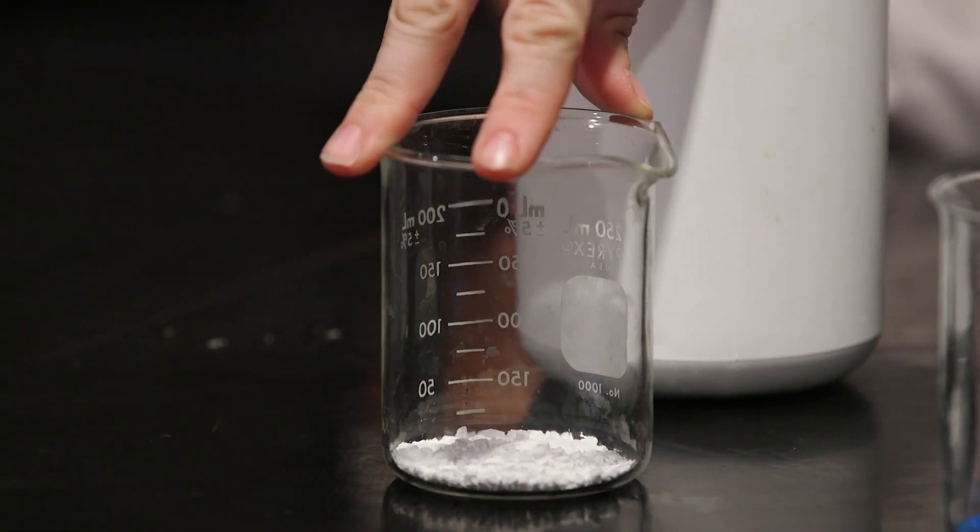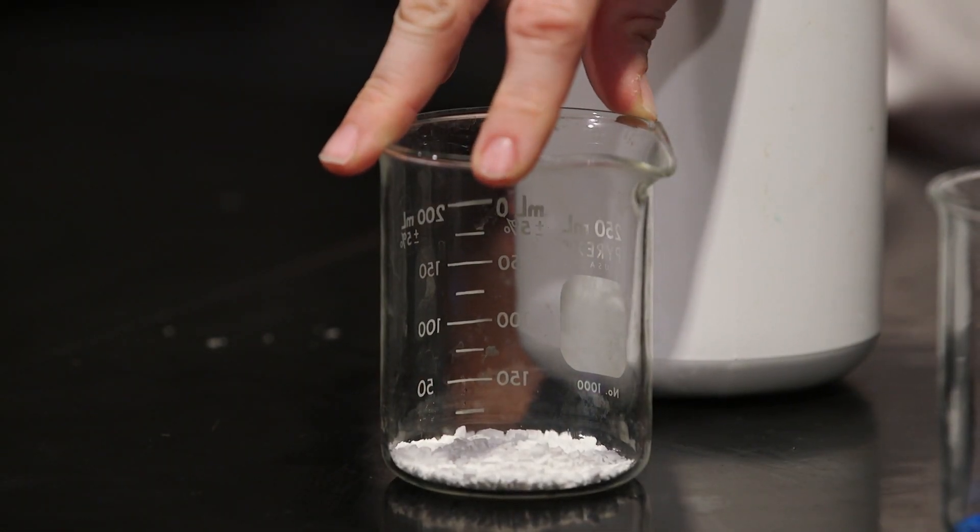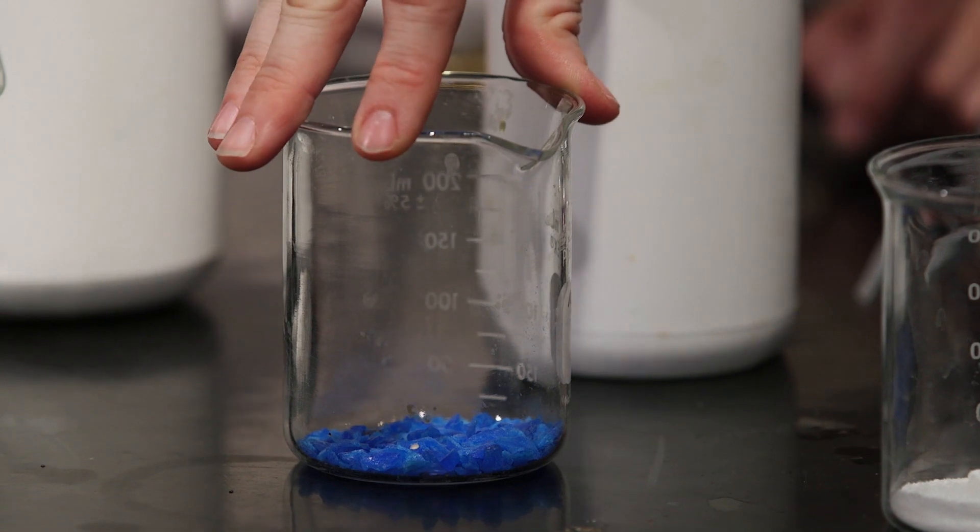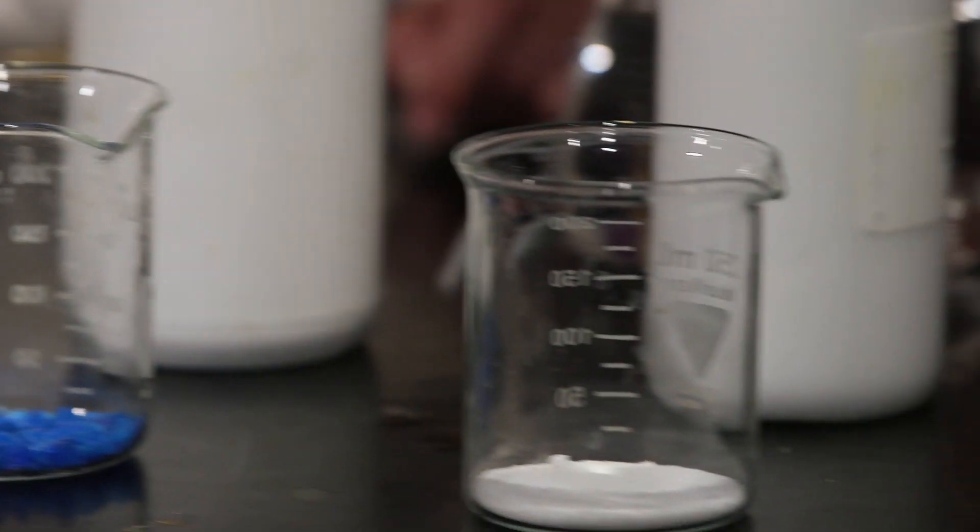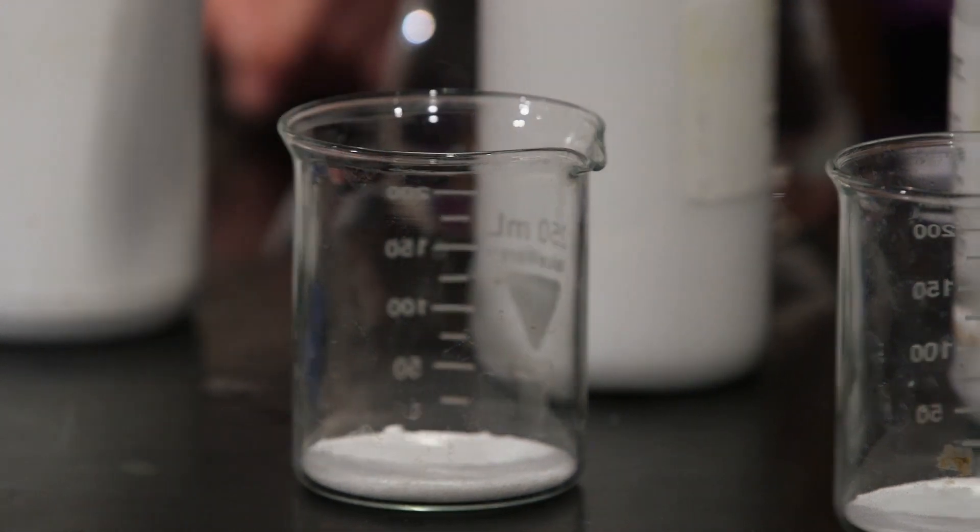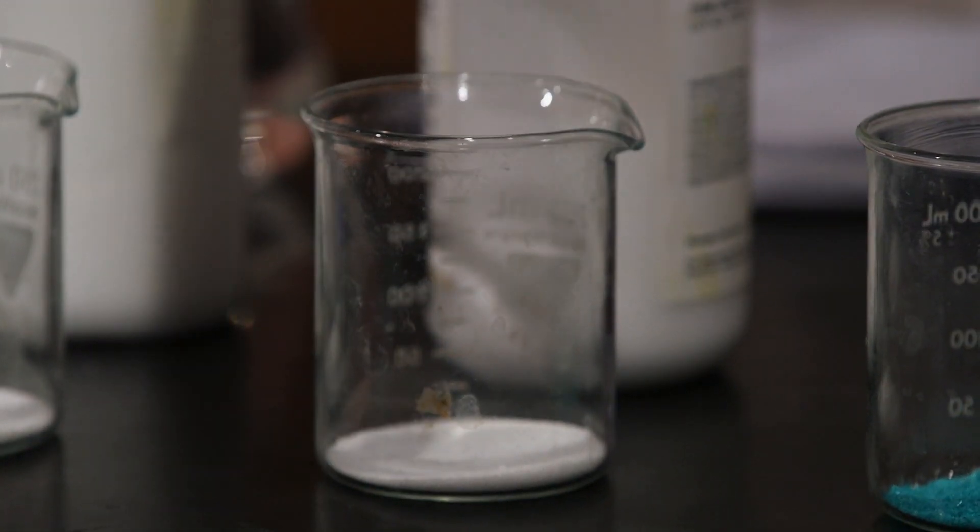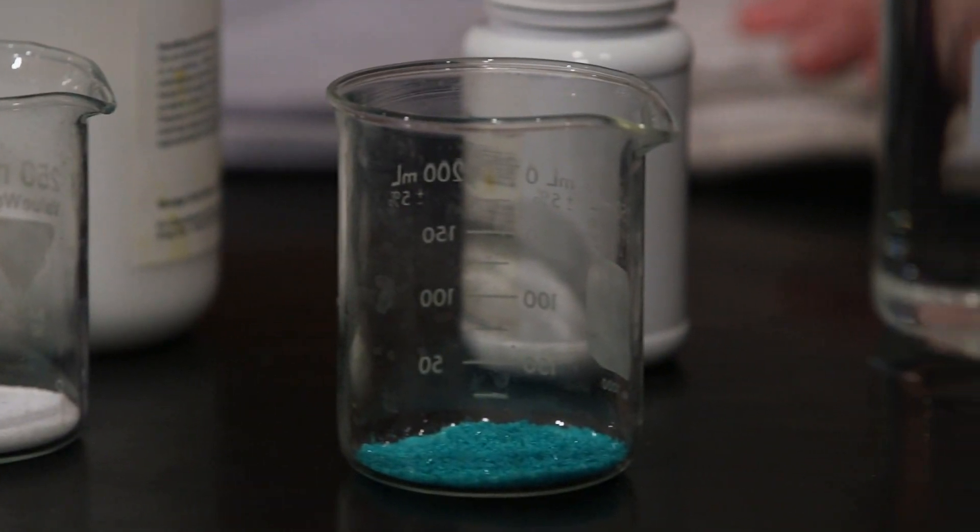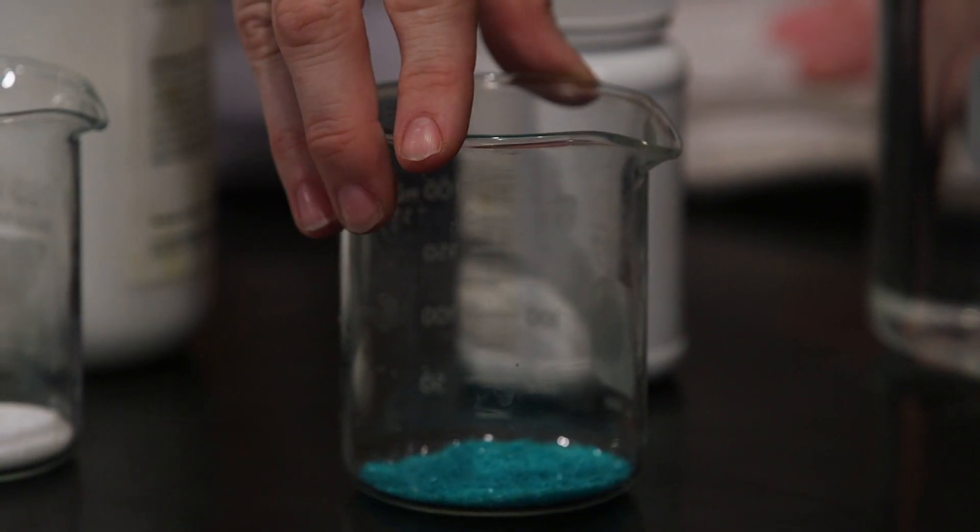The first beaker is our calcium chloride, next we have our cupric sulfate, next we have our strontium chloride, next we have our potassium chloride, and finally we have our cupric chloride.